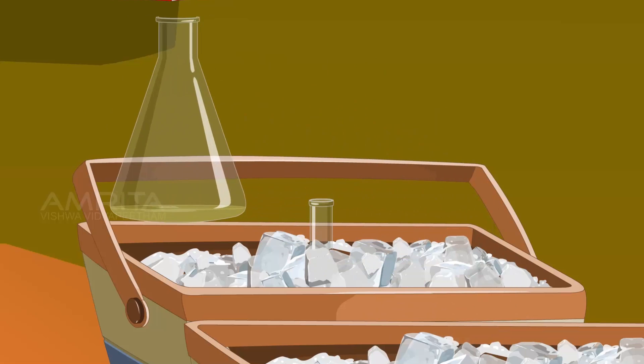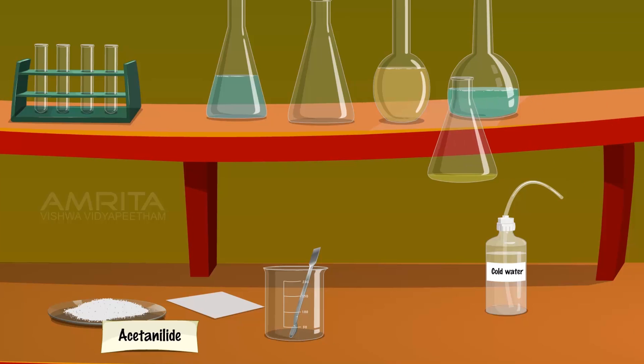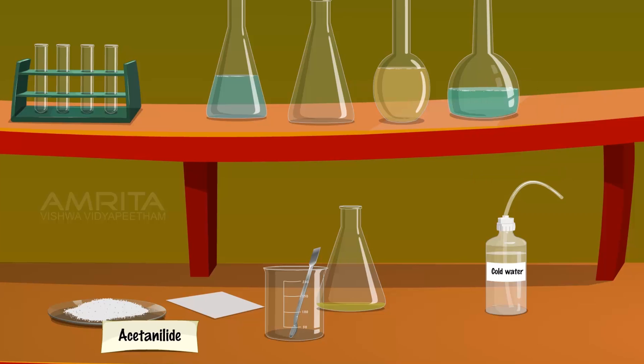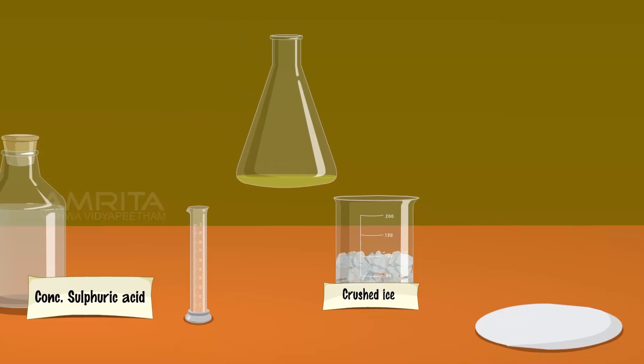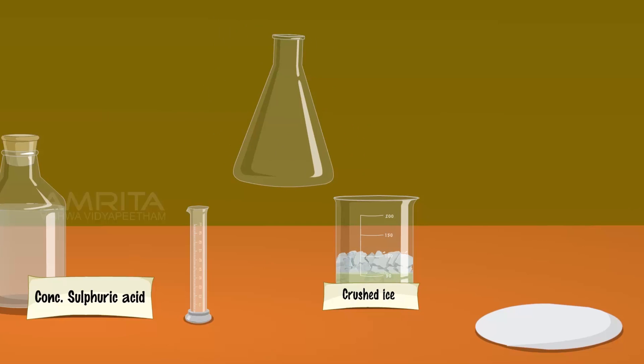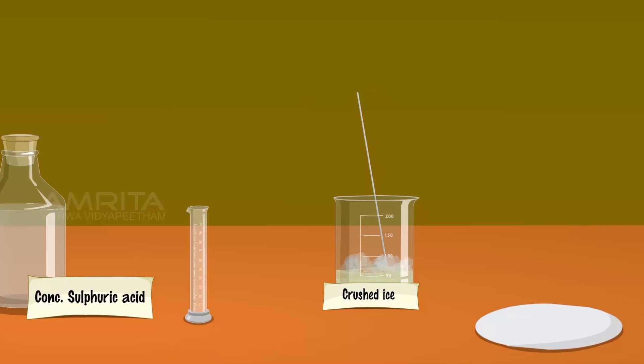Remove the flask from the freezing mixture. Allow it to stand for 30 minutes at room temperature. Pour the contents of the flask into crushed ice taken in a beaker and stir it well. A precipitate is formed.